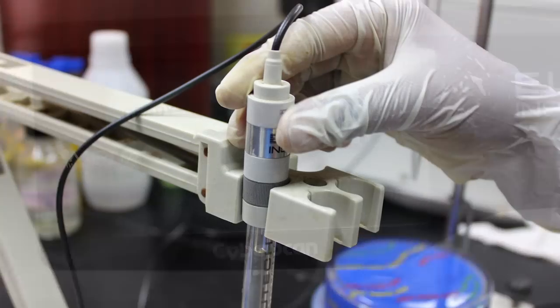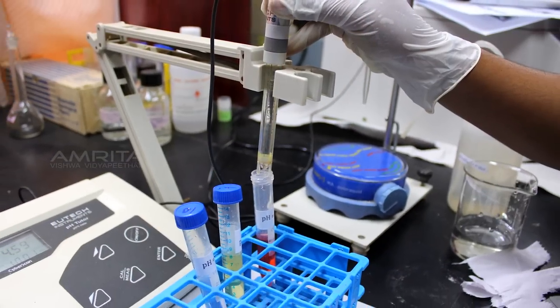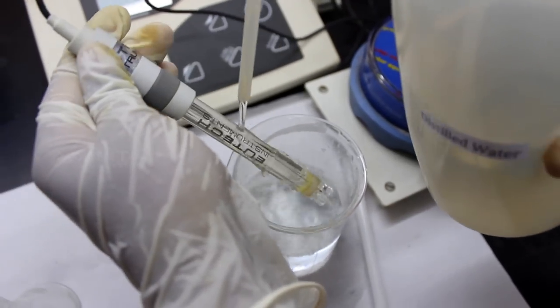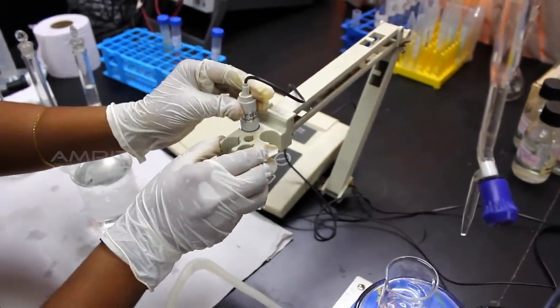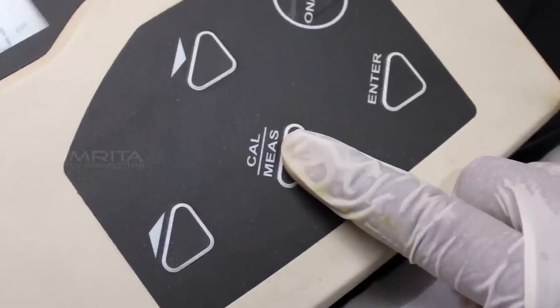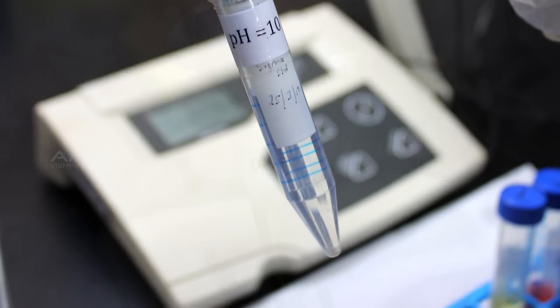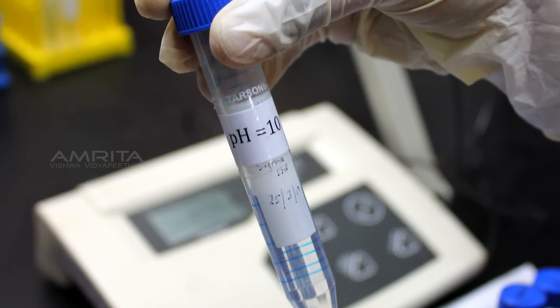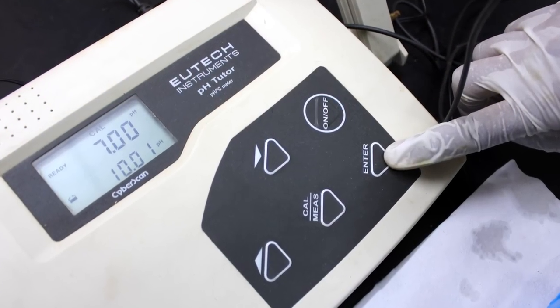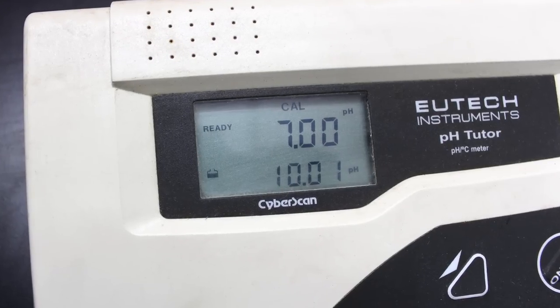Take out the pH electrode from the pH buffer labeled pH equals 4 and wash the electrode thoroughly with distilled water and wipe the electrode after placing it back on the stand. Repeat the same step while dipping the pH electrode into the standard buffer labeled pH equals 7 and pH equals 10 respectively. Now record the value displayed on the pH meter which is observed as 7 and 10.